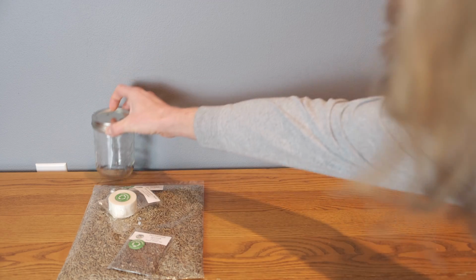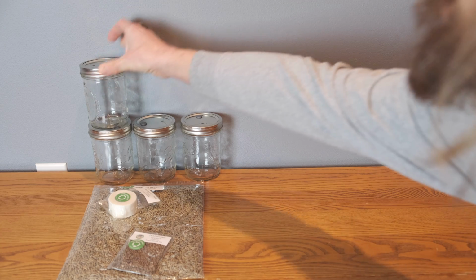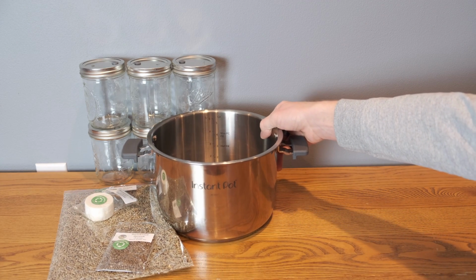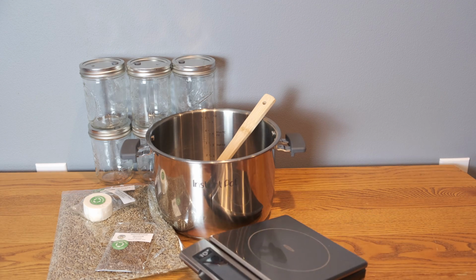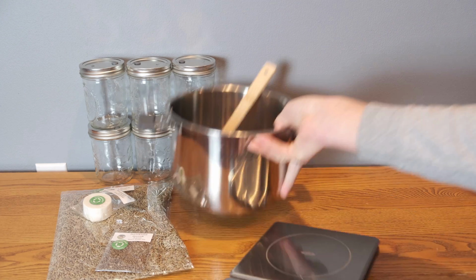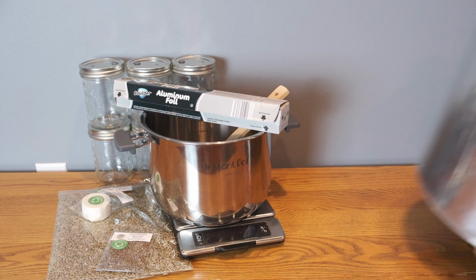For this project, I'll be using dry rye grain, pelletized gypsum, a roll of micropore tape, 6 glass jars, and these are 1 US pint jars. And I have them fitted with these vented lids that have a self-healing injection port, a cooking pot that I can put on the stove, a mixing spoon, a gram scale. If you don't have a gram scale, you can use mixing spoons and cups. 1/2 US cup is equivalent to 90 grams of dried rye grain, and 1 US teaspoon is equivalent to 3.4 grams of gypsum, aluminum foil, and of course the pressure cooker.